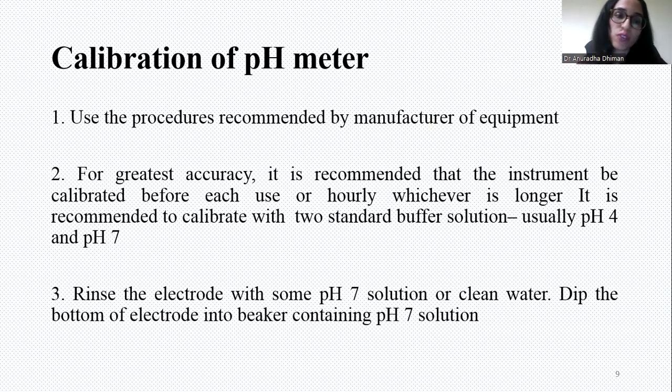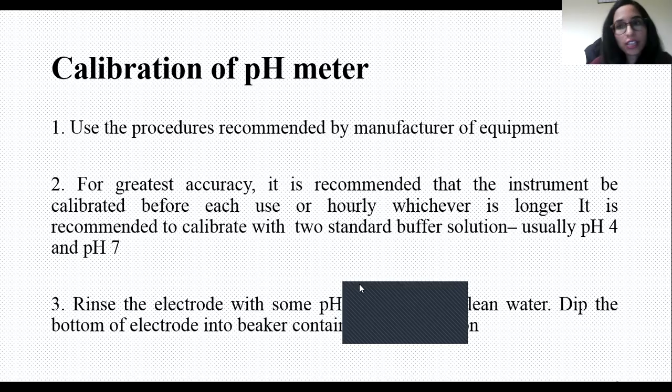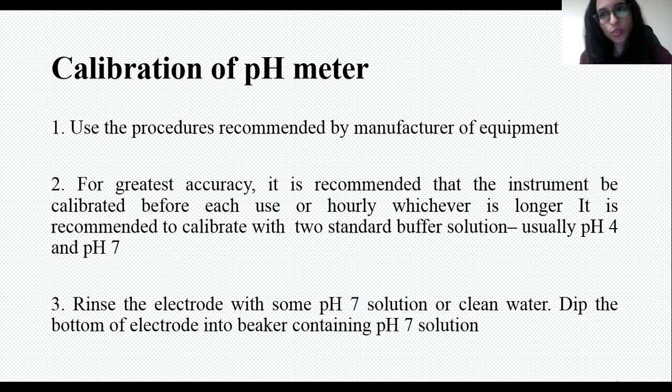We need to display the SOPs on the instrument.